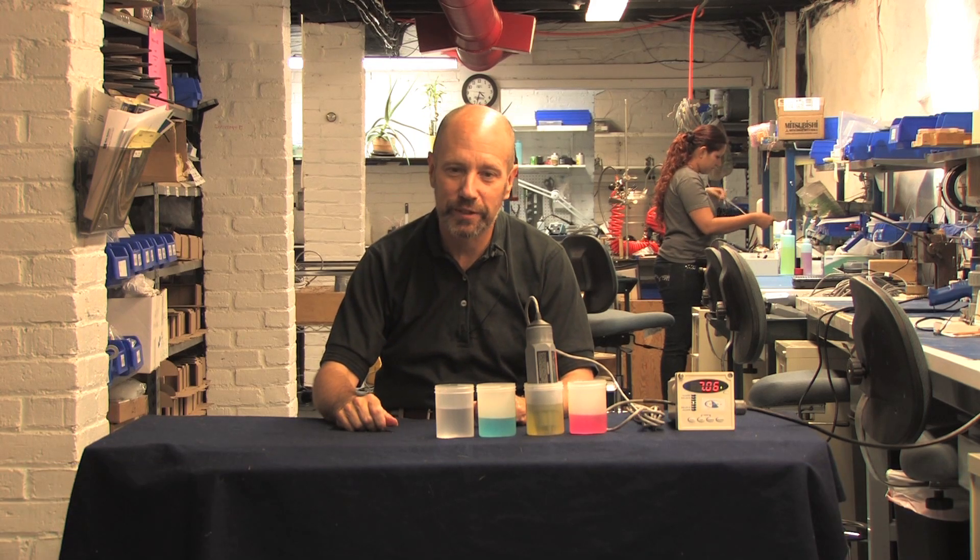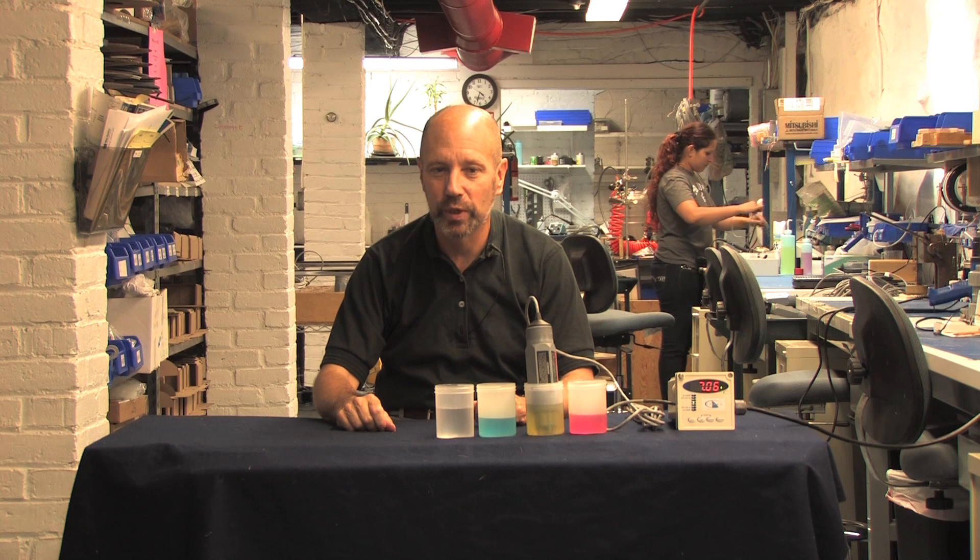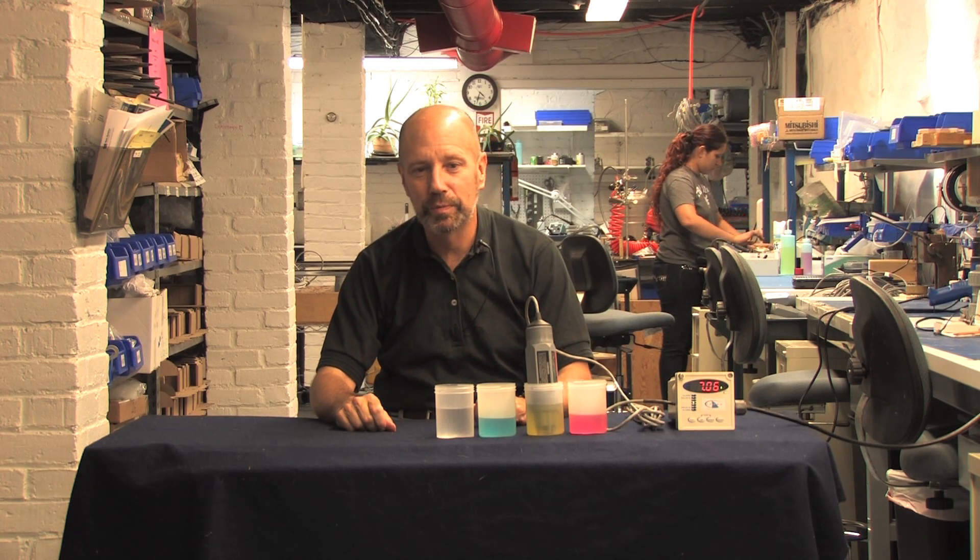Hi, I'm Mark Spencer, President of Water Analytics, and I'd like to welcome you back to another instrumentation training video. In this video, we'll pick up where we left off in the previous one on calibrating a pH probe.